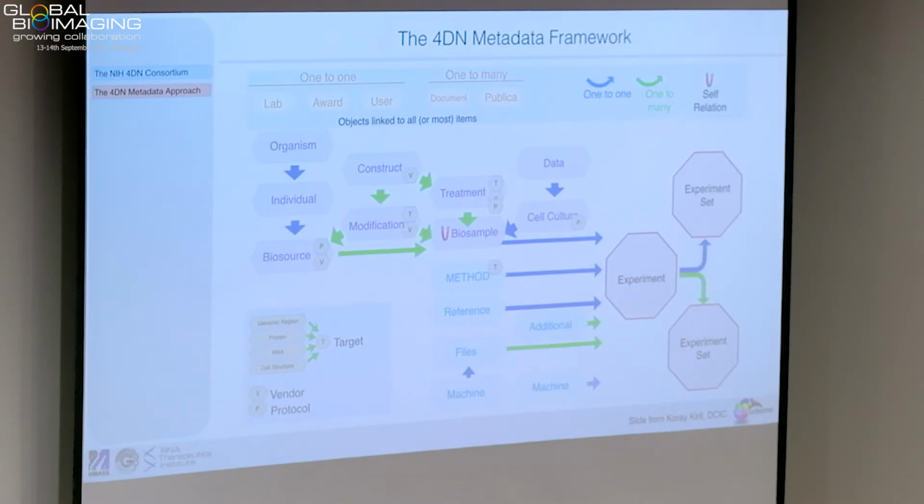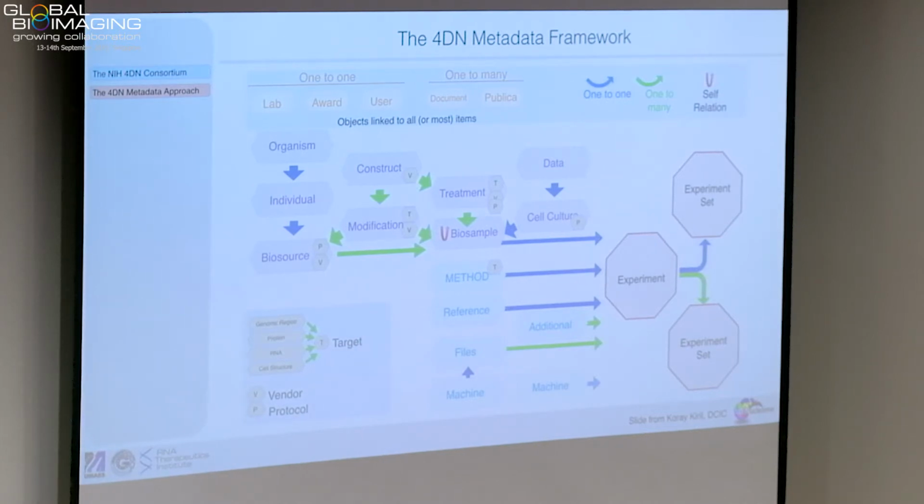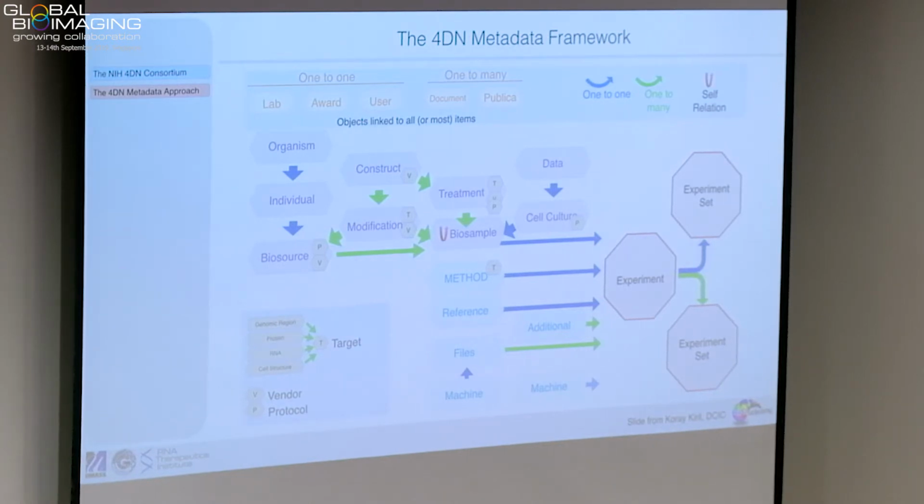We have a handle on how to document biosources and origins. We have ontologies that describe those problems. We have implementations from ENCODE, from the 4D Nucleome, from EMBL, from even OME in some form. So there is structure there. And that structure is missing for imaging.